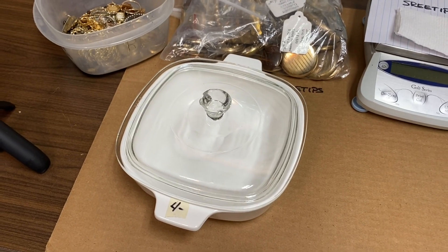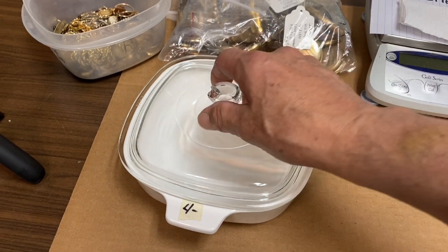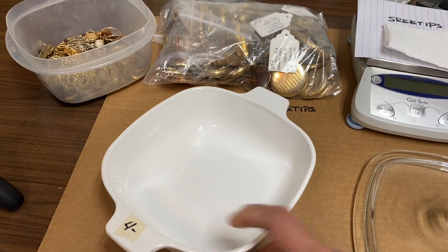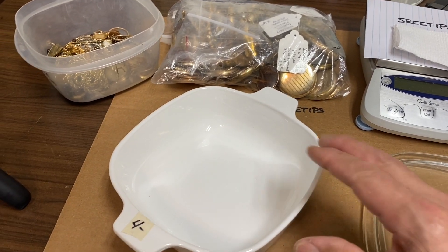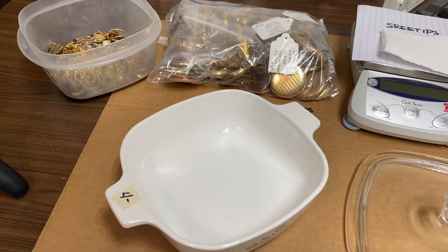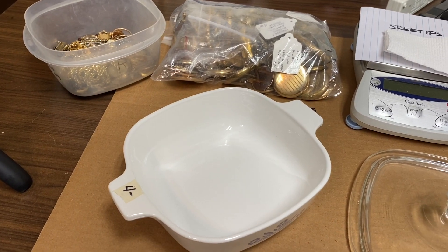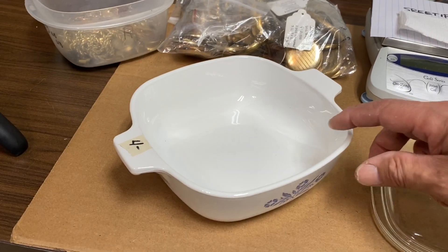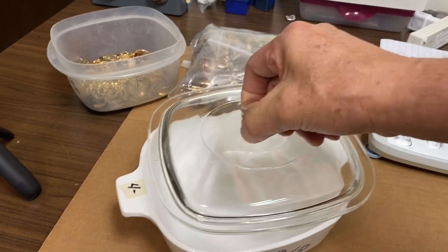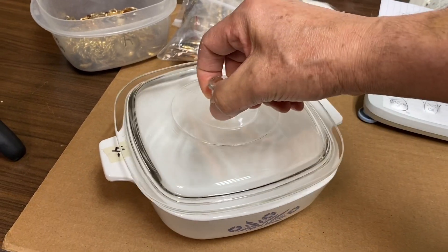These things are tough — they'll take a lot of heat. They will not take a direct flame though. I tried to dry off some cement silver one time: I had a bunch of wet cement silver in here, had it on high, walked away and forgot about it, and it shattered.